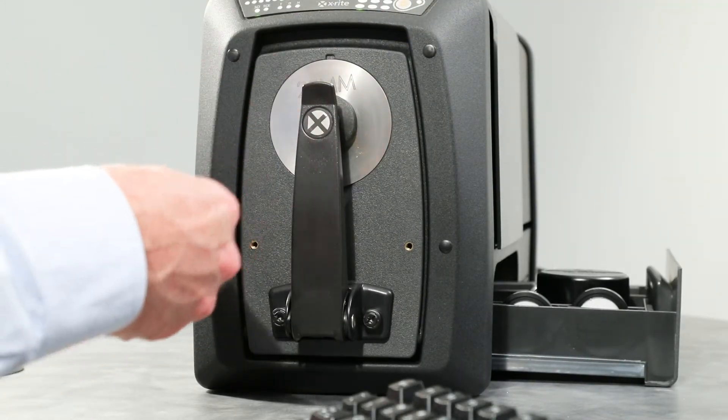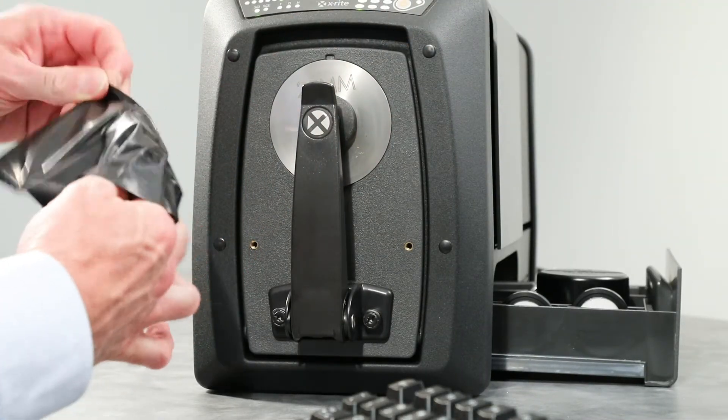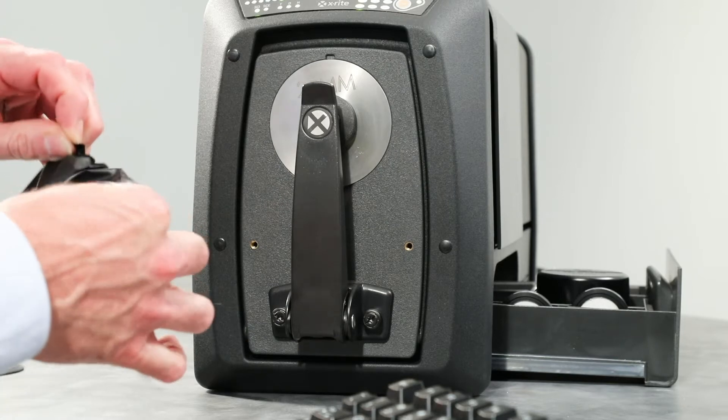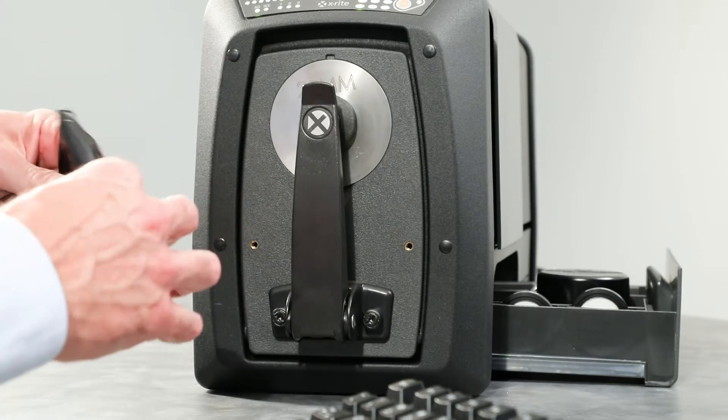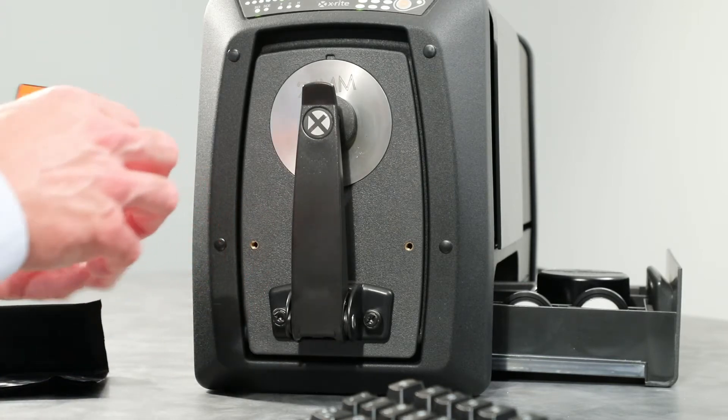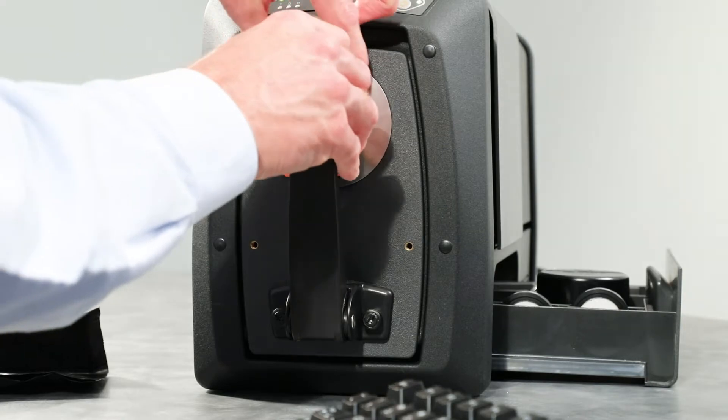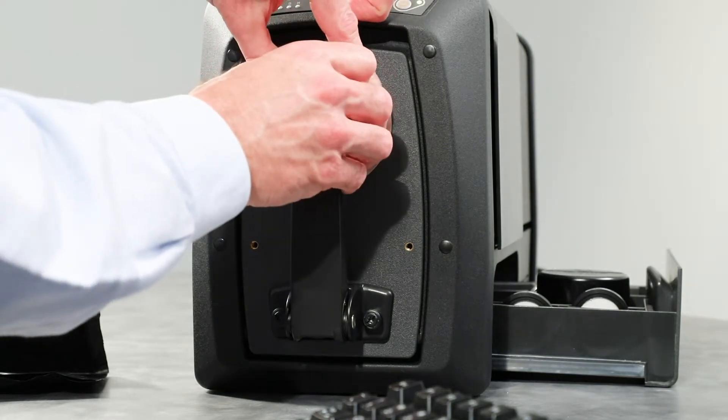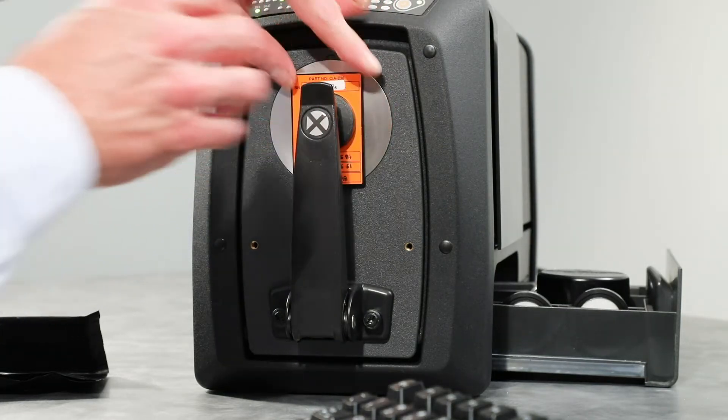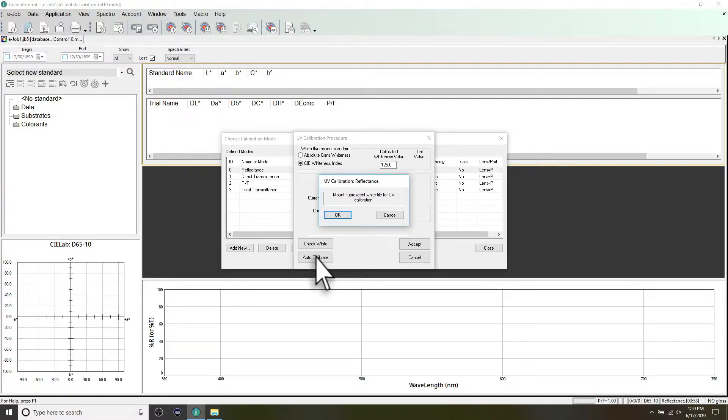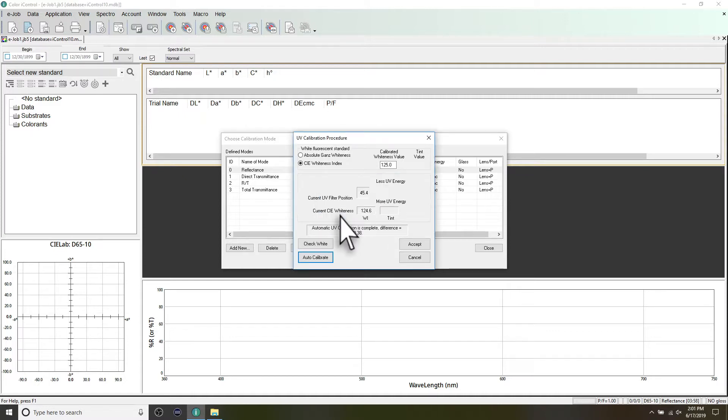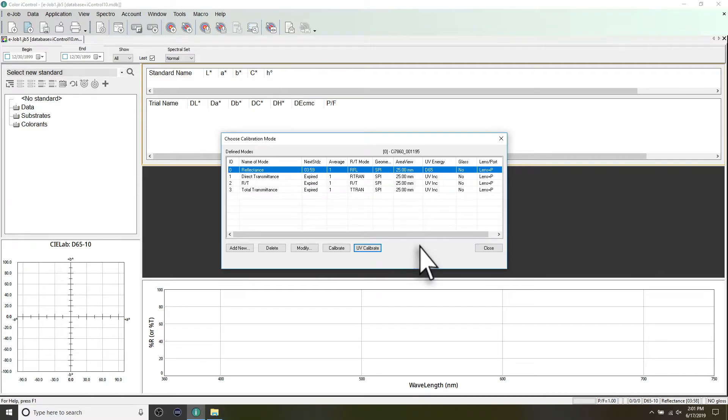Next, remove the UV-calibration plaque from the protective bag in the accessory drawer. Position the UV-calibration plaque with the white surface facing the aperture port. Initiate the UV-calibration from the software. Repeat the normal white and black calibration procedure as required. Click Accept once finished.